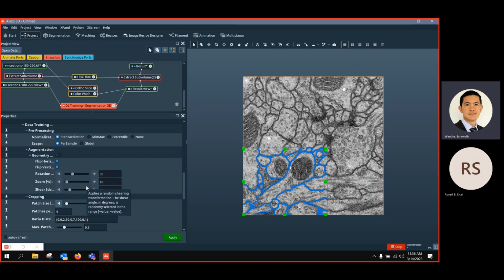So you create new images with the feature: if you flip them, you then have more mitochondria on the right side and on the bottom side as well. You give the model the opportunity to see all the possible features that could appear in your images. Otherwise, the model will not be completely trained on the true data distribution inside your images. So that is augmentation. We don't use it right now because our data is quite okay without augmentation.